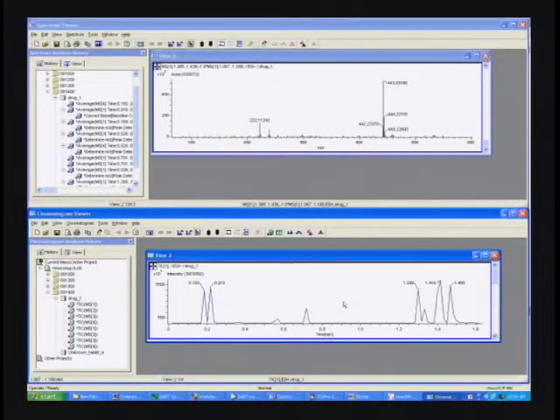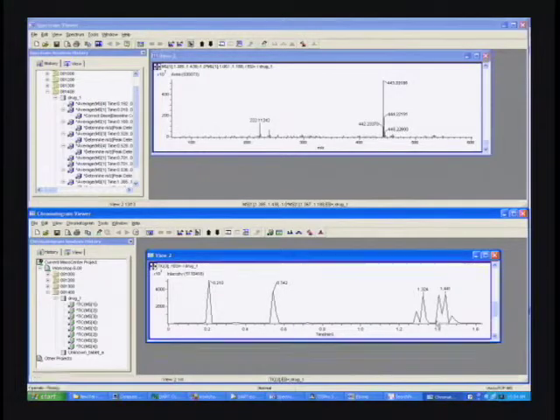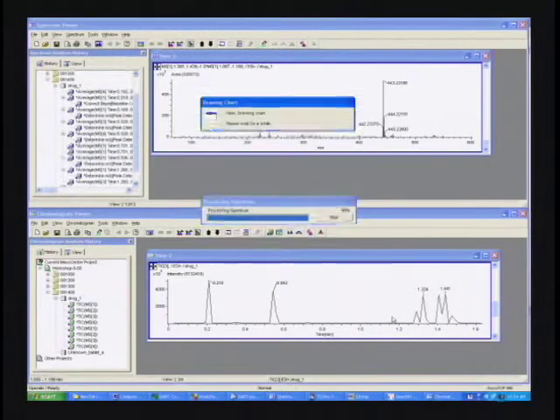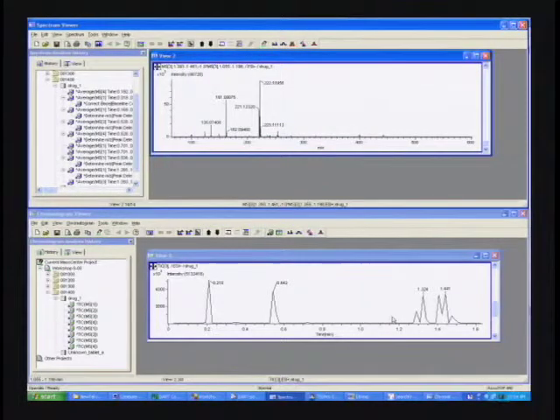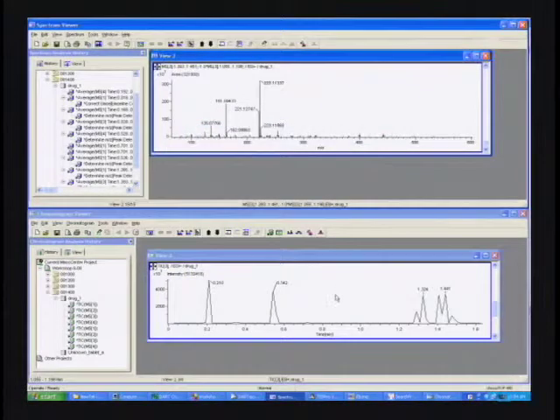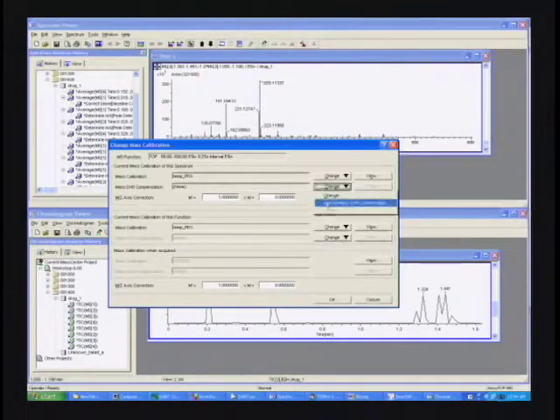So we'll save that. Let's slide down to the 60 volt spectrum, and we'll save a spectrum here also. We'll pull that up, and we'll be able to search this then in the search from list program, this spectrum against spectra that are already saved there. So we'll centroid the peak. We've applied our peg calibration. We haven't applied our lock mass to this one. We can go ahead and do that just to show you.